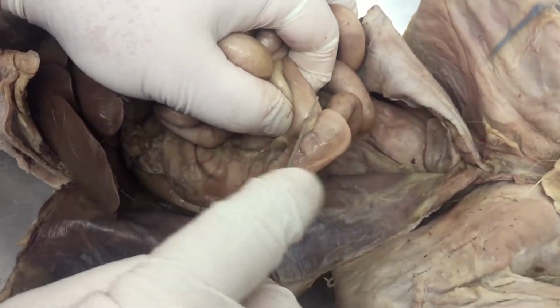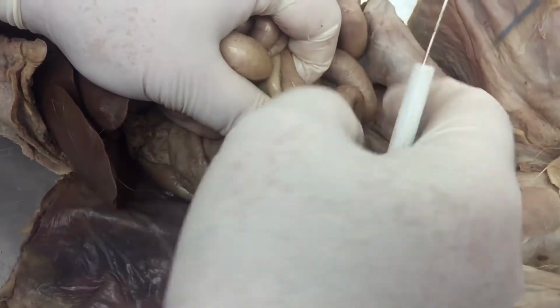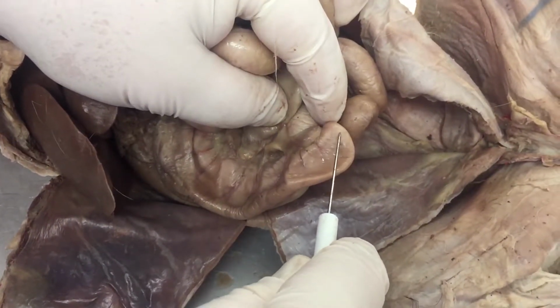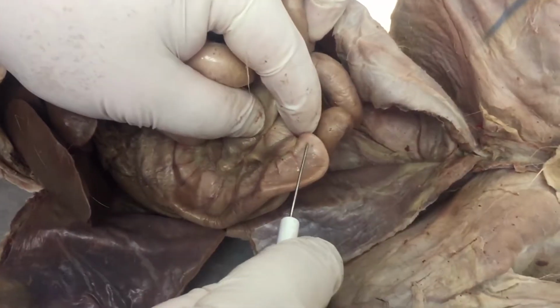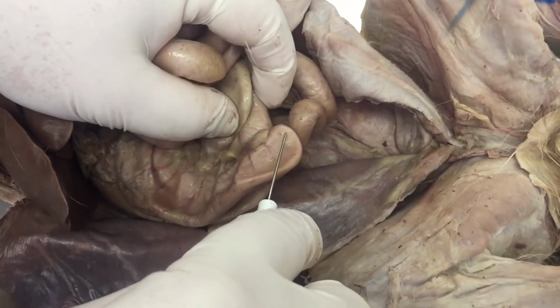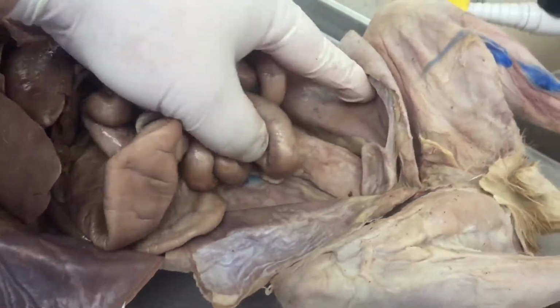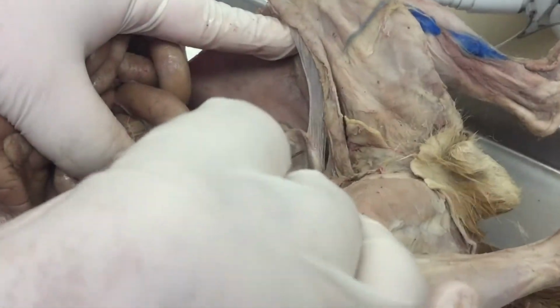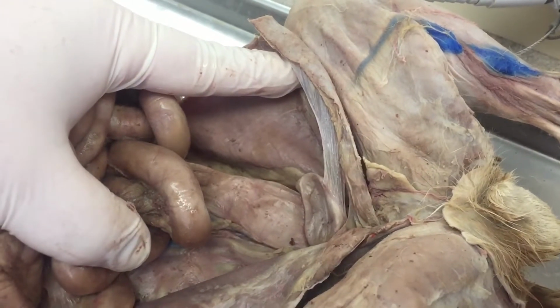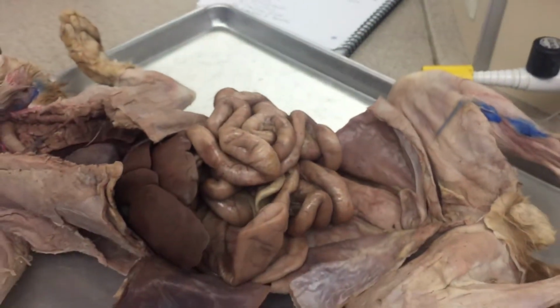And right at the point at which the small intestine enters the large intestine is this little pouch that is actually not in there. This is the cecum. In humans, that would have the appendix attached to it. So cats don't have an appendix, so you don't see anything, but this is the cecum right here. Lastly, the one last thing you can see is this little bag that is right between the legs. That is the urinary bladder. So I think that goes through all the parts that we have.